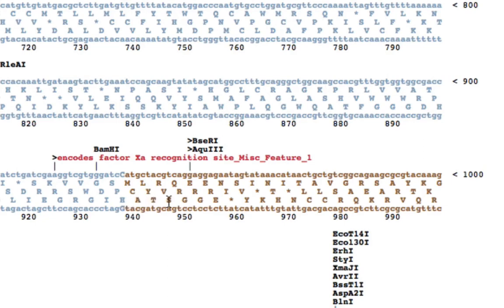We want BKK56 to start with methionine in reading frame 3 and not 1. The problem we are facing is that in the third reading frame it starts with nucleotide G. Somehow we have to push the AT in such a way that instead of GCT it should start with ATG, right? So we need to push A and T by 2 nucleotides, so that in the third reading frame it starts with ATG and not GCT.